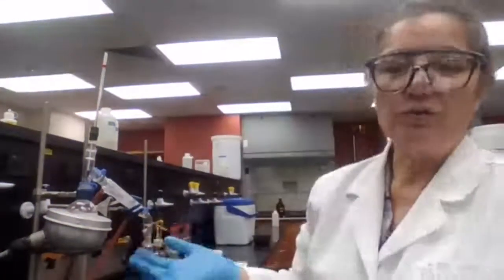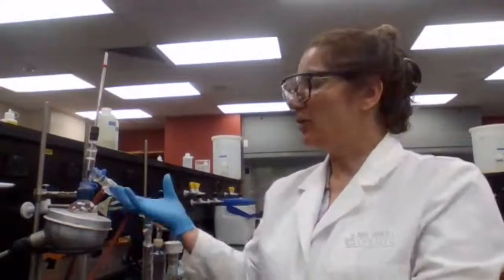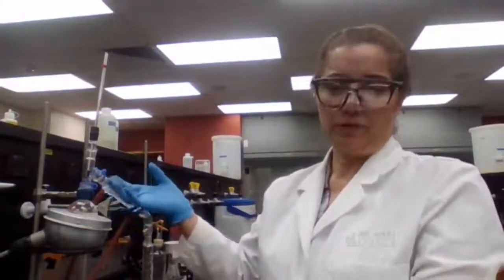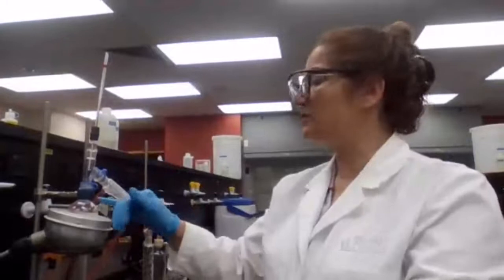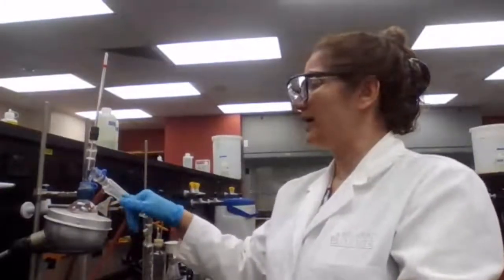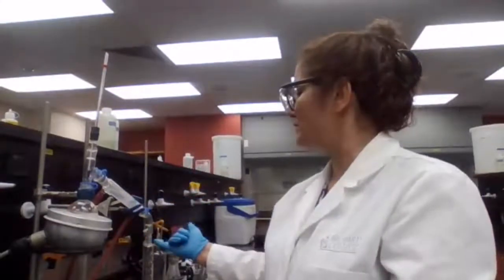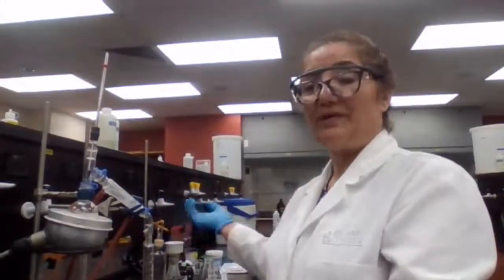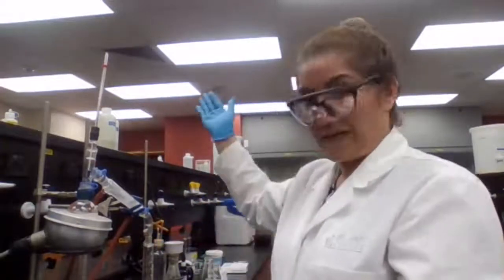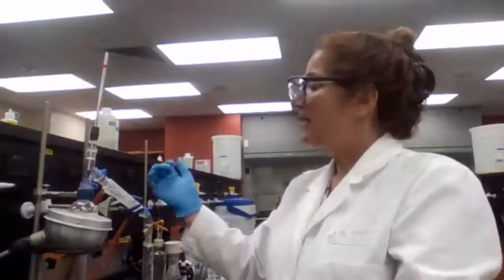The general rule is you want to have gentle boiling. You don't want too much vapor to be produced, because if too much vapor is produced, then the condenser is not going to have time to condense the vapor into liquid. So the vapor is going to escape, and that means we are losing our product.